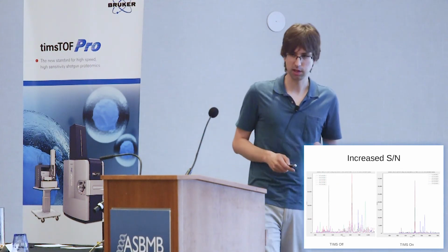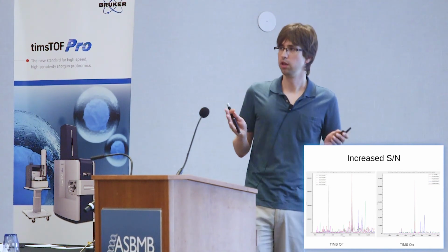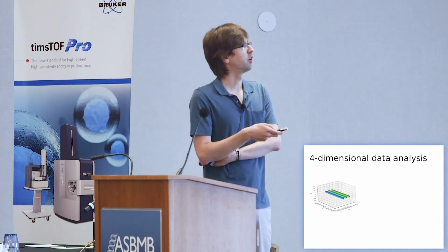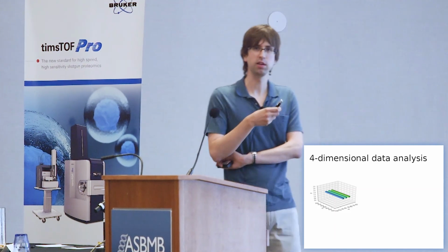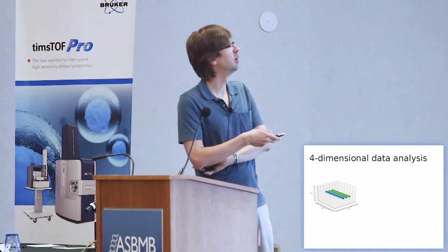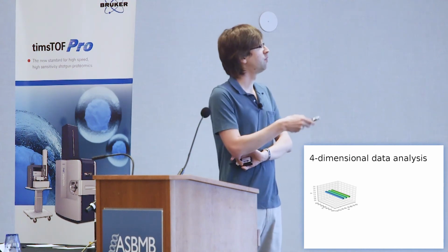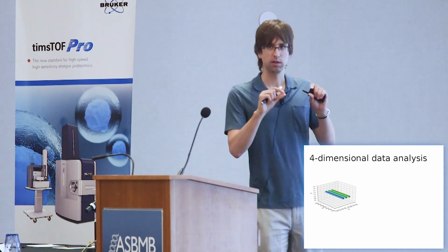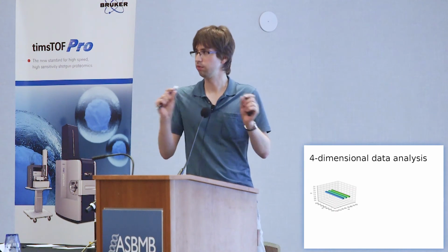So of course, this is a single example, but then we asked, how does this now look on a global scale? And so what our software is now able to do is this type of analysis automatically for the full library of hundreds of thousands of peptides. And the data is now arranged in a three-dimensional space of ion mobility, retention time, and mass to charge. And the regions of interest are three-dimensional pixels, or so-called voxels.